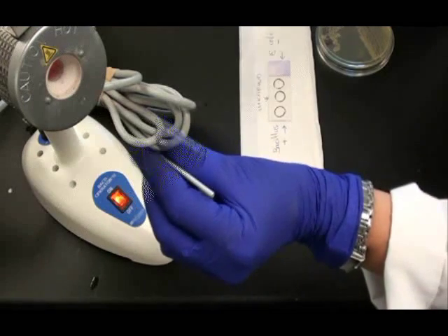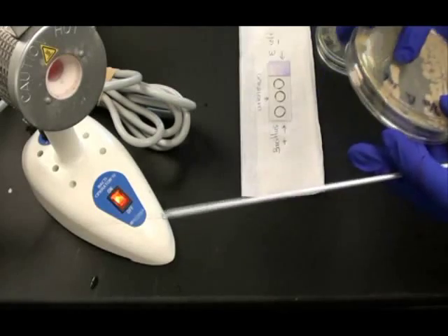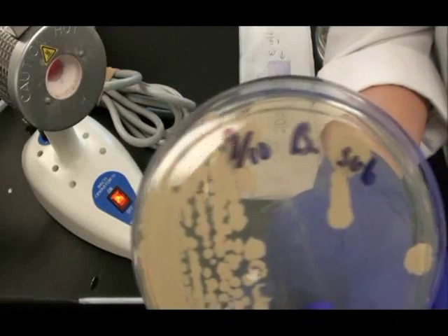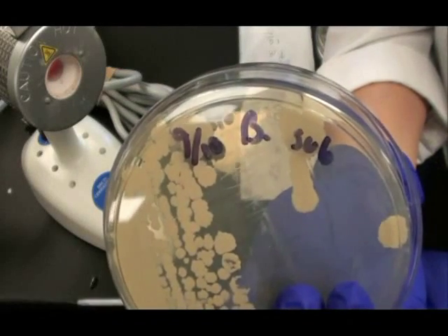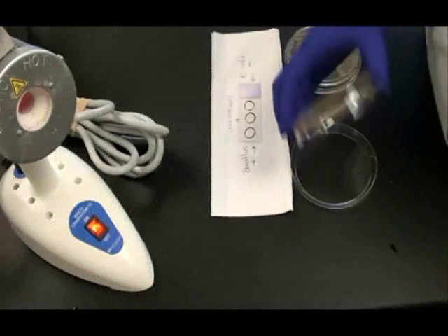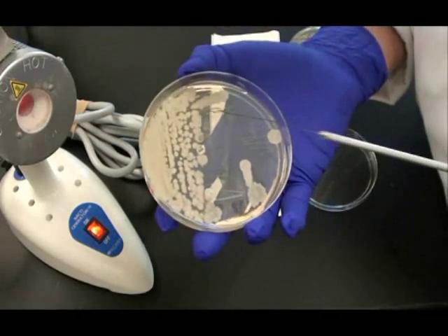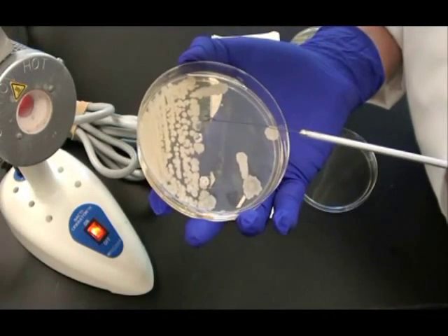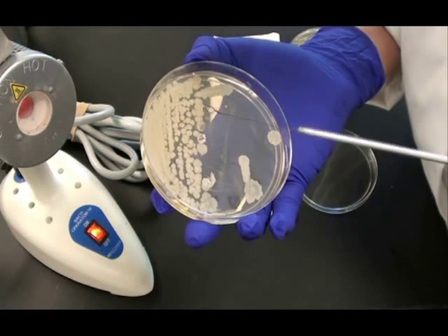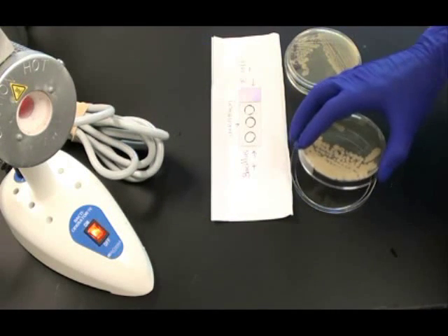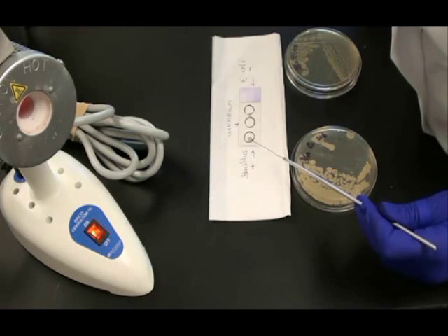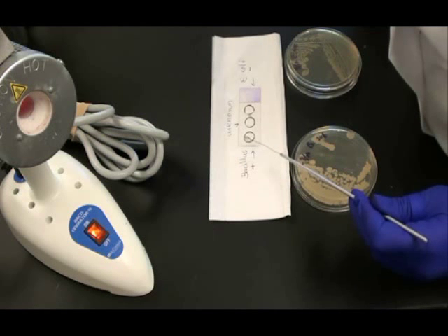Now I sterilize my loop. I do this between each step, 5 to 10 seconds, then allow it to cool. Then I will be obtaining my positive endospore control, endospore producer Bacillus subtilis. I take the cooled sterile inoculation loop and run it across a colony of B. sub. Then I mix that sample into the water in the circle on the right side of the slide.